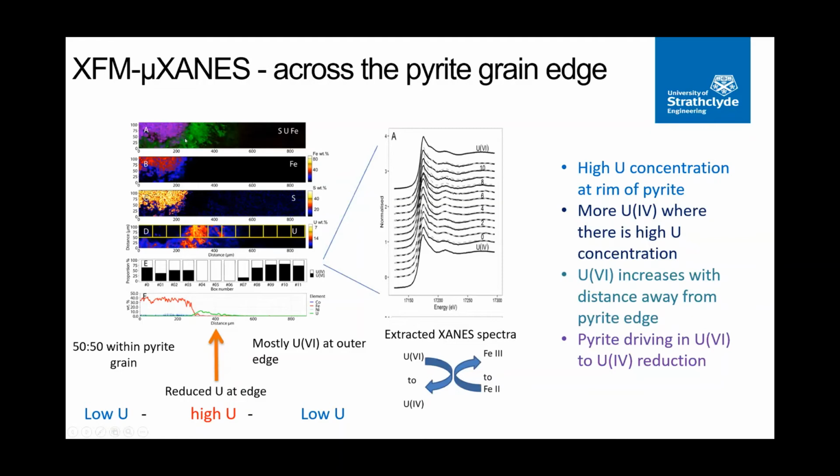So at the top, there's the image of, I'll start with uranium, sulfur, and iron, that makes up the pyrite, and the RGB at the top there. And then you see the uranium crust, very highly concentrated. This correlates to, and this is in weight percent, a uranium peak here, and some other elements which on the same scale can't be shown.